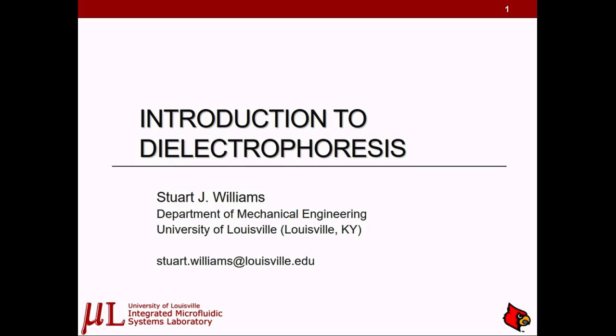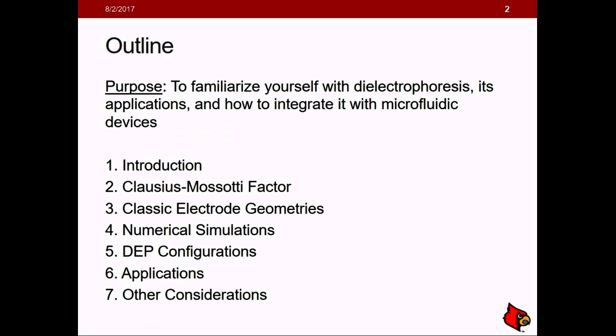And dielectrophoresis is a good technique to perform separations as well as trapping. But in terms of the purpose of this talk, it is just to familiarize yourself with dielectrophoresis, the applications, and how you can integrate this with other microfluidic techniques.